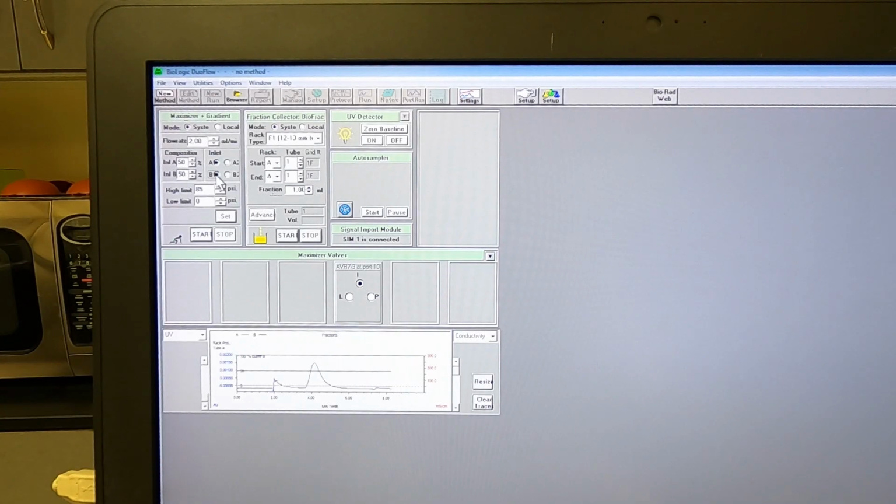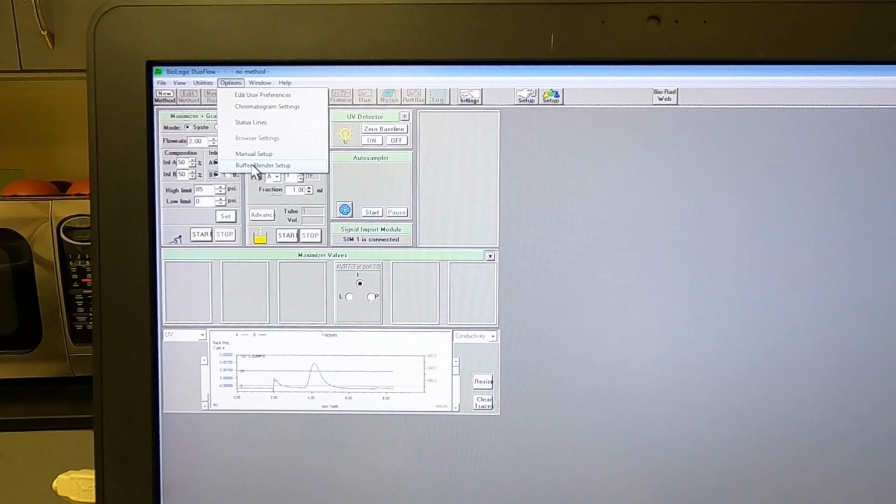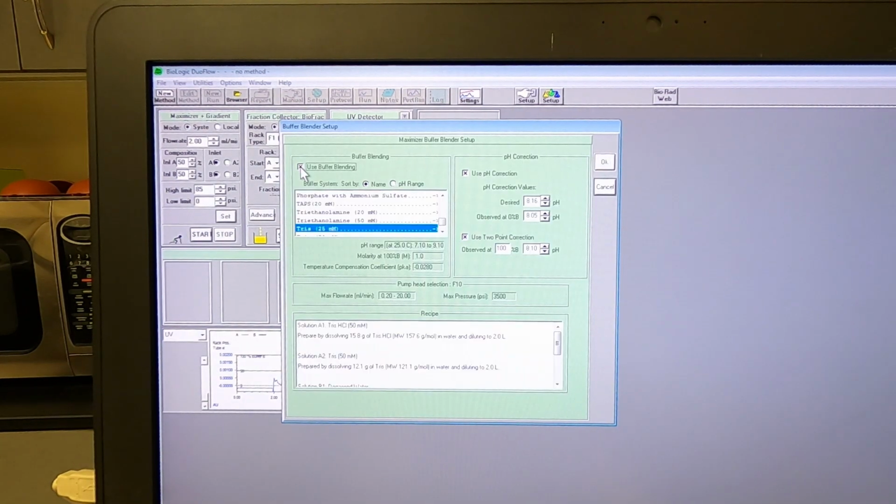What we want to do is put the system in the buffer blending mode. And so to access that, we can go to options, buffer blending, or you can go to this little quick button here with the multicolored icons. Check the box for use buffer blending. We're using Tris 25 millimolar. So I'm going to push OK, and then again pay attention here to the pump control menu and how it changes once we've got buffer blending selected.